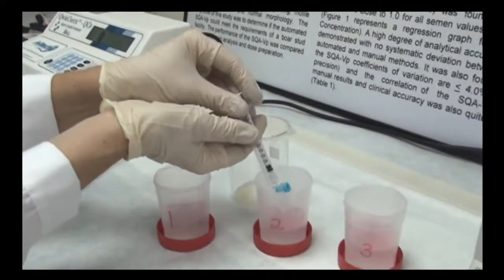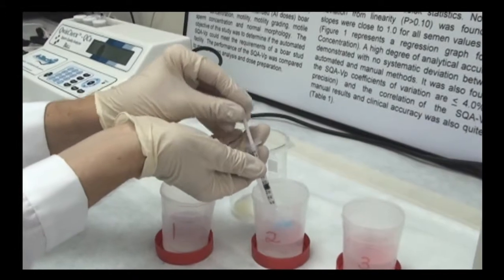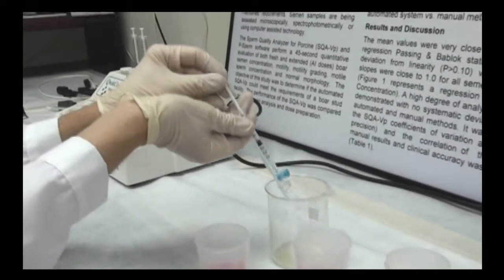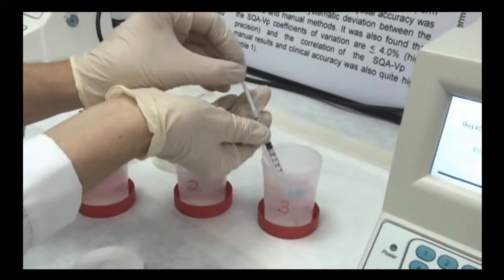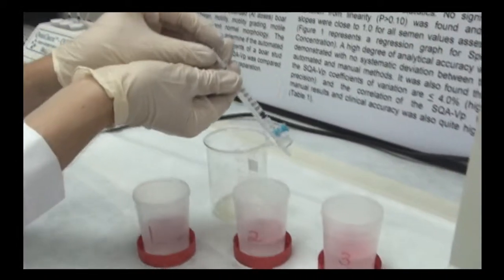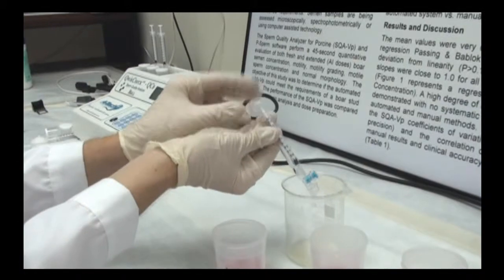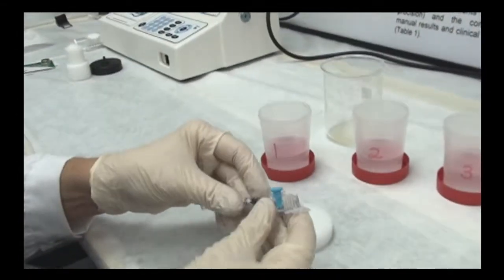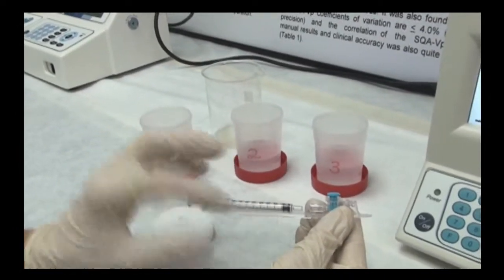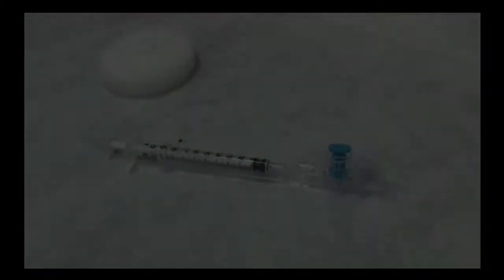Then, repeat this process in cup 2. It should also contain distilled water. Lastly, repeat the same steps in a third cup containing 95% isopropyl alcohol. Pull the syringe part way out of the cuvette section and allow to dry 24 to 48 hours. If done correctly, no residue will remain in the testing capillary after the procedure.